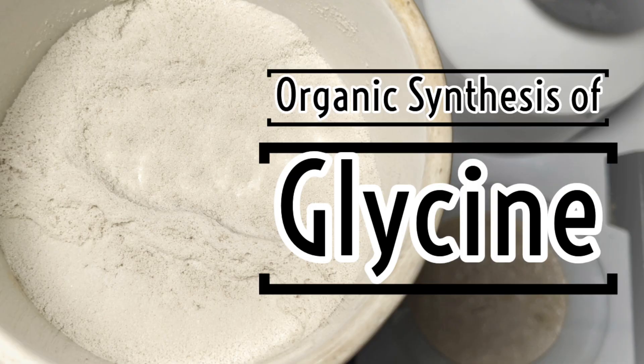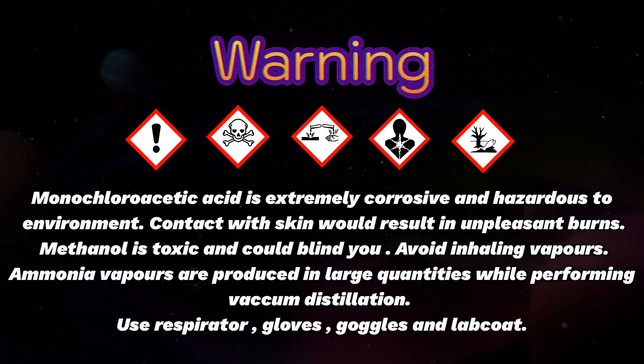Hello friends, in this video we will be synthesizing glycine using monochloroacetic acid and ammonium carbonate. This preparation is adapted from Vogel's book of practical organic chemistry.